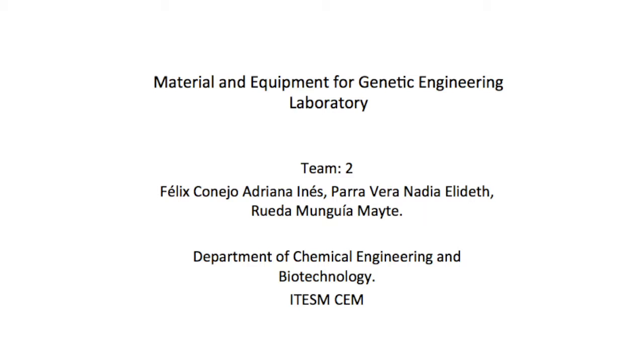It's important as a student and future professional to know all the equipment and materials that are useful in the laboratory, and more important, how to use everything in order to make good practices. This video explains how to properly use the materials that are in the laboratory, especially how to use micropipettes.